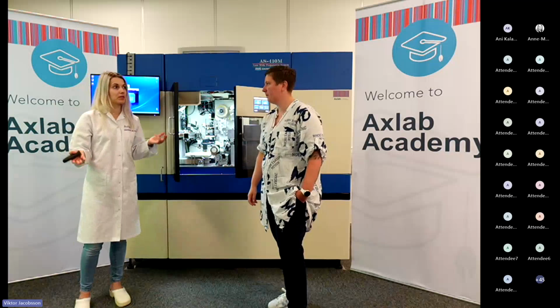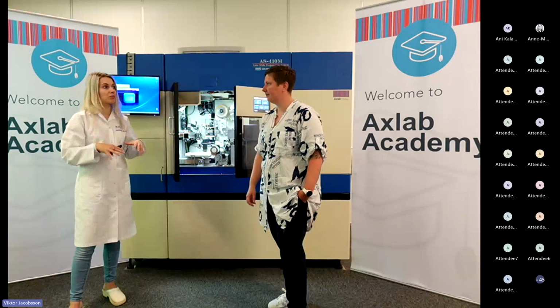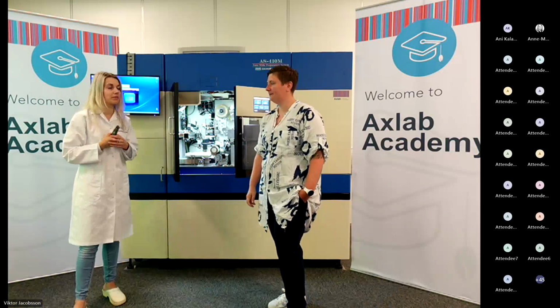For the most part, when there is service, it will be a half to a whole day where there is a technician on the machine to check it out. And with the increasing install base, it also puts pressure on which spare parts we actually have in stock. So we are gearing up more, because with the install base we have, we are trying to accommodate everybody. Every part, yeah.